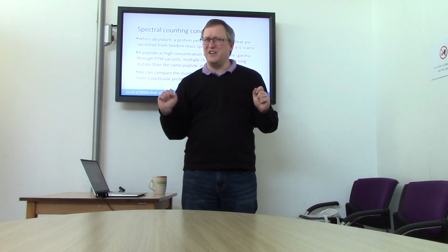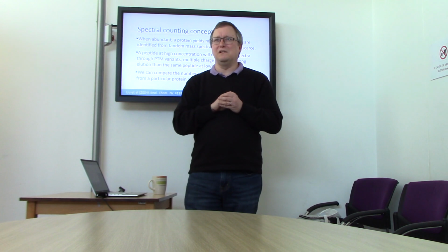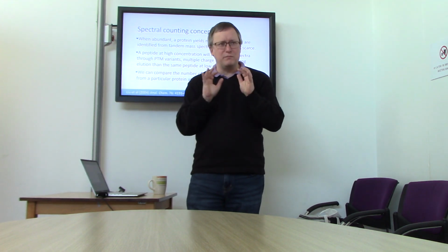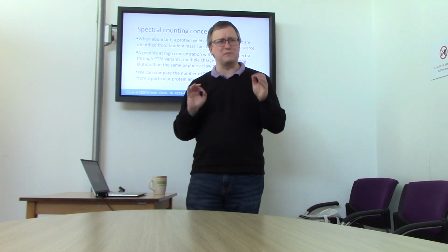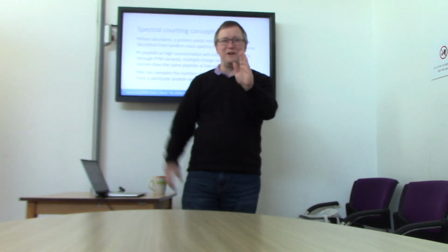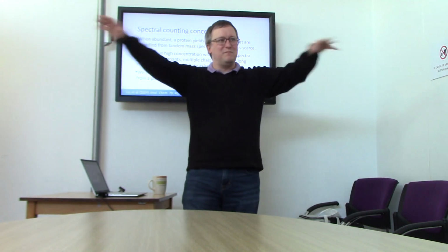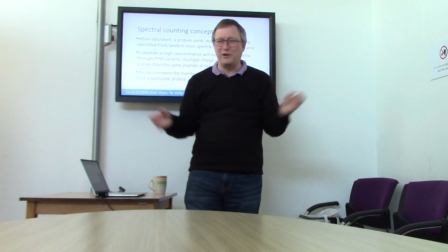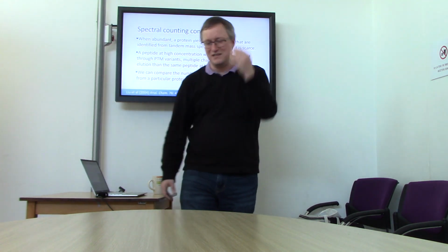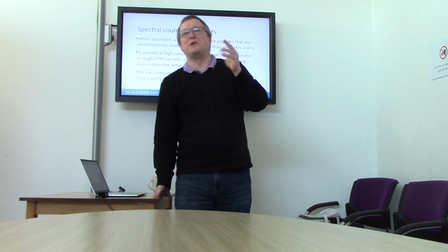That may not be obvious, but I would try to put forward a model where we think of each protein as an iceberg. If you have steady seas and there's no ice around, you can see plenty of that iceberg. But as soon as you're in a really messy background with all kinds of icebergs floating around, your ability to see deep into that iceberg is abolished. That's maybe not a very good metaphor, but we'll work with it.